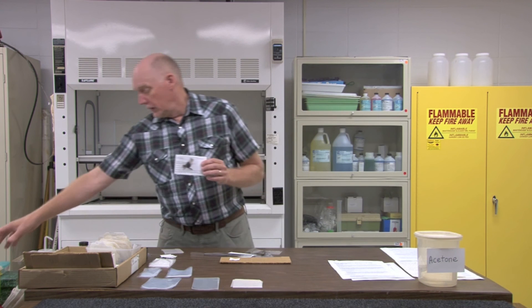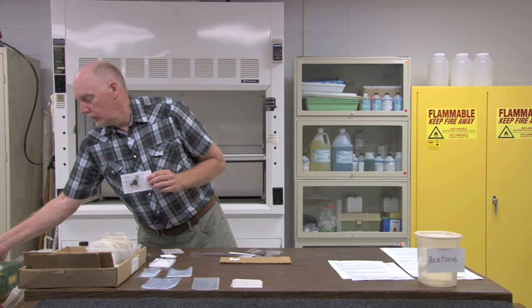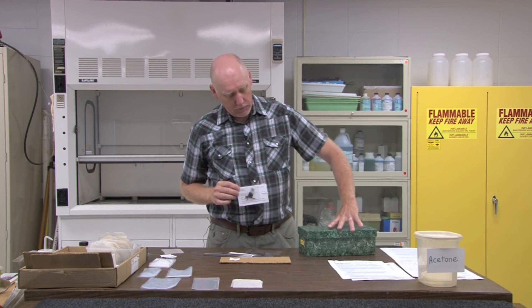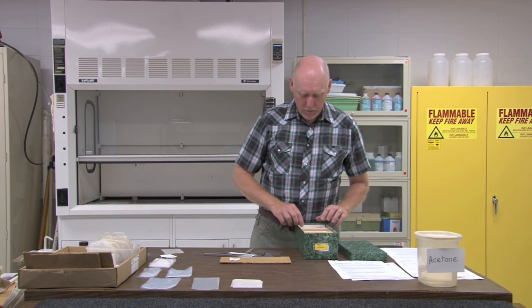At this point, it's ready for storage into an appropriate storage box. I make my own storage boxes out of 3x5 file card boxes and store the specimens vertically where they take up less room.